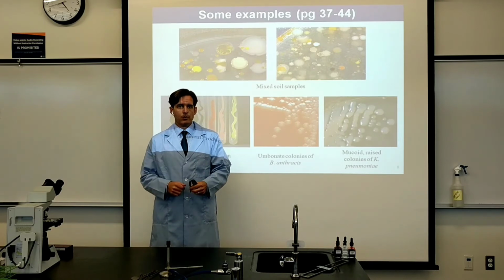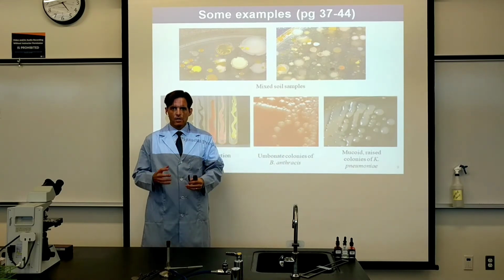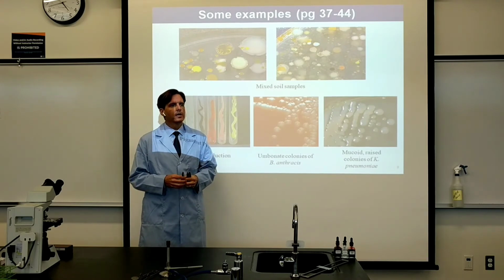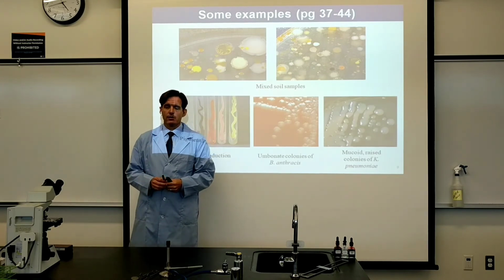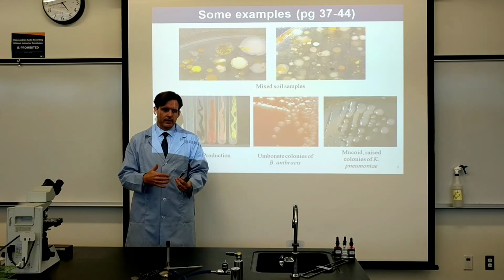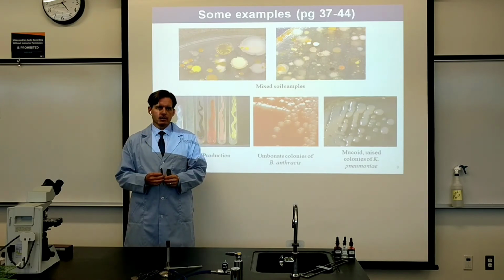Generally speaking, what we're going to be observing in just a moment is that the colors will get a little bit brighter or more vibrant because pigments have had a chance to build up more, colonies have had a chance to get bigger, and also importantly, fungi, which are slower growing types of organisms that are different than bacteria, will have had a chance to actually grow where bacteria may have grown already very quickly.